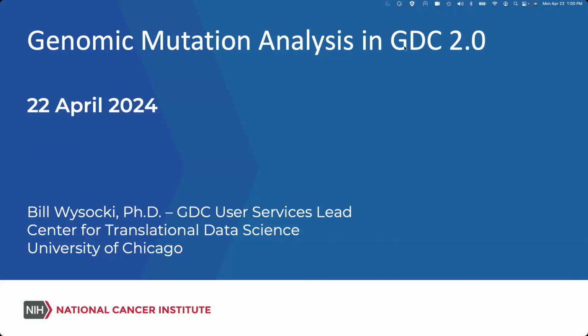My name is Bill. I am the lead for the GDC User Services team, and today I'd like to talk to you about genomic mutation analysis in GDC 2.0. I'd like to show some of the features and things that GDC 2.0 can do.